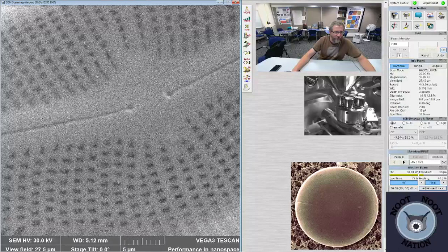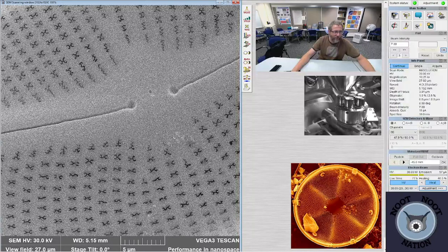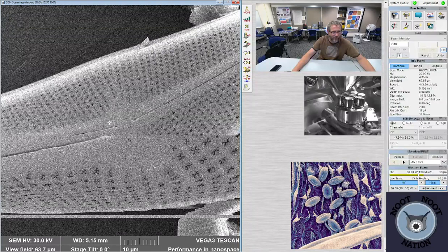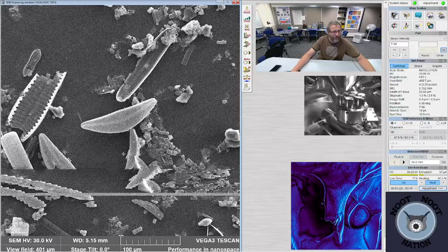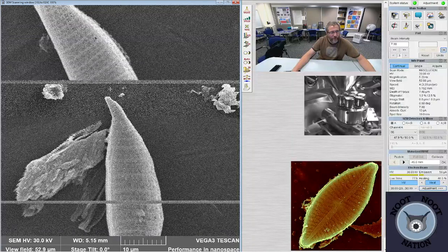Oh, these ones are kind of like X-shaped. There they are. Like little calligraphy patterns. That's Cymbella mexicana. As I mentioned, the striae always look like this. They're composed of these really intricate, they look like hieroglyphic characters, basically. So the whole things are that way. And we see these regularly in California. I never realized how common, because we don't see them very frequently here, but a lot of the samples I've seen from Dell and Pacific Plankton are filled with that diatom. It's really common in California.